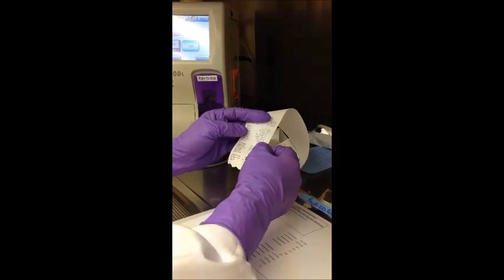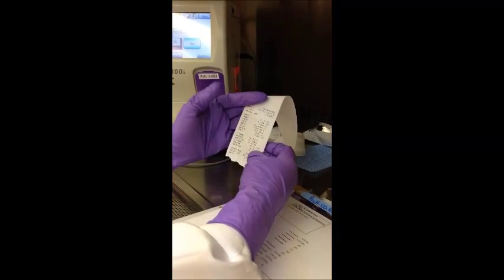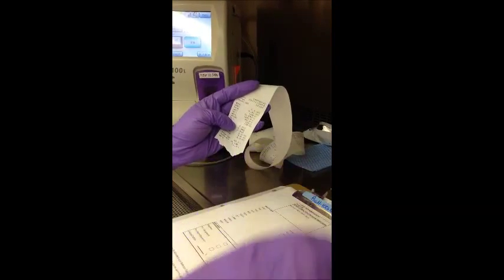The person inside the cabinet will be dictating these parameters to the person outside the cabinet, who will have this particular chart, and they will be handwriting the dictated results onto this particular chart. They will also read back the results as per last protocols.